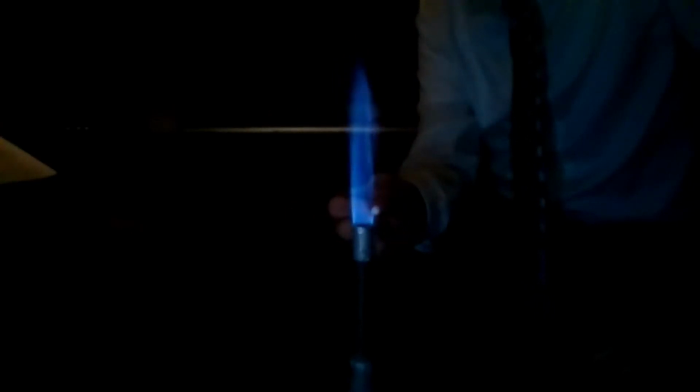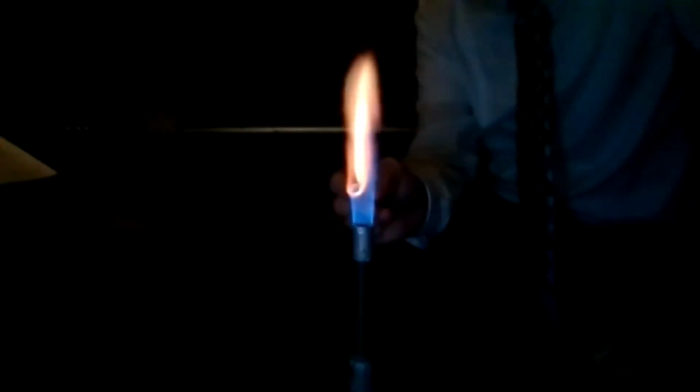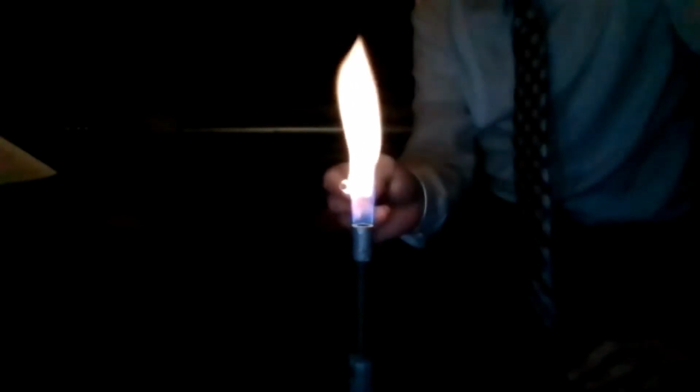Once again, somebody new, tell me what's happening. Why is it turning yellow? Wait, which element is this? This is barium. Why is it turning yellow? The electrons are getting excited and then they drop back down. Exactly. To do that, they have to release photons.